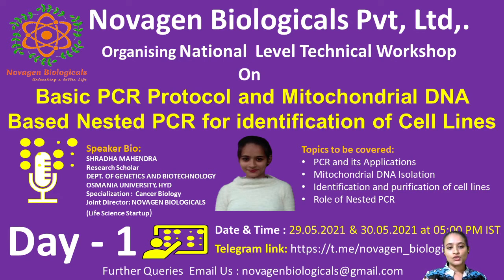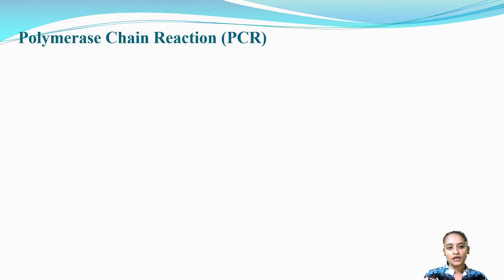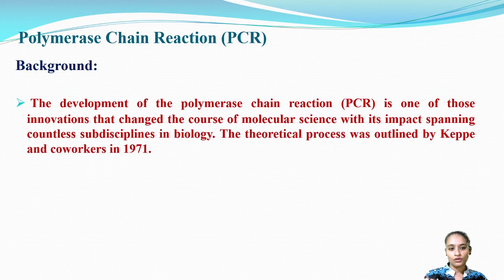So let me start today with the basic PCR protocol, which is a day one technical workshop. I would like to talk about the background behind the polymerase chain reaction. As we all know, in microbiology, the microscope is the great invention where we can view microorganisms which we cannot see with the naked eye.